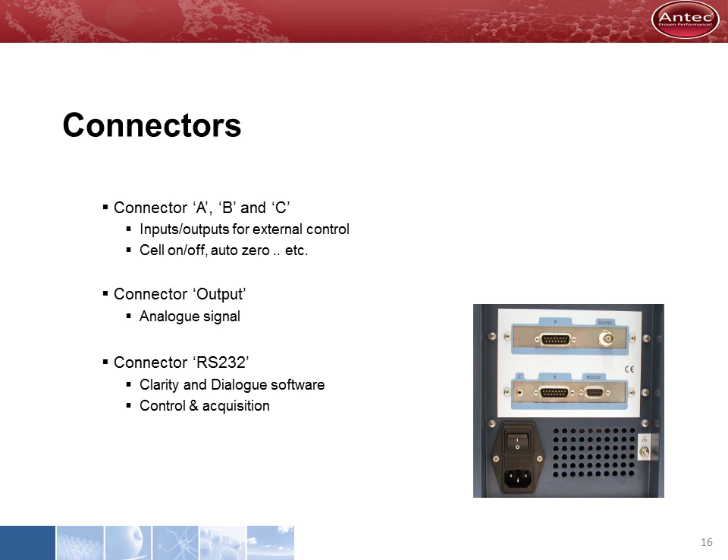On the rear panel, a number of connectors are located. There are connectors for external control, for example to trigger the AutoZero. The output connector is for analog data acquisition and an AD converter. A serial port is available for computer control, for example when using our Clarity data acquisition software.